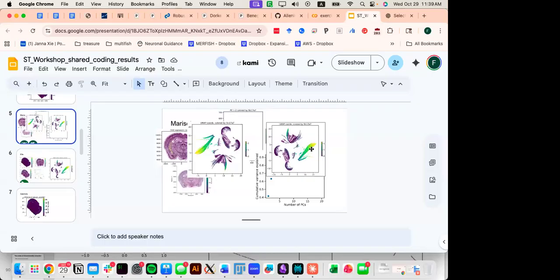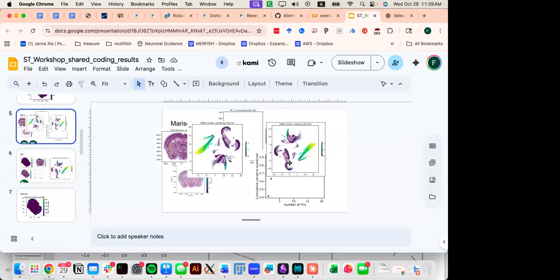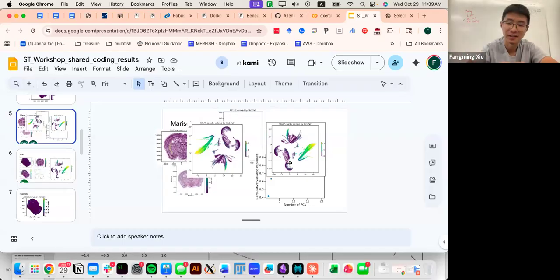What it tells you is you have a few islands or neighborhoods in this data, where certain groups of cells are more similar to each other than others. That's it. You can trick UMAP into producing many different shapes as you like, and they all work equally. By UMAP's standard, they all reduce dimensionality equally well.